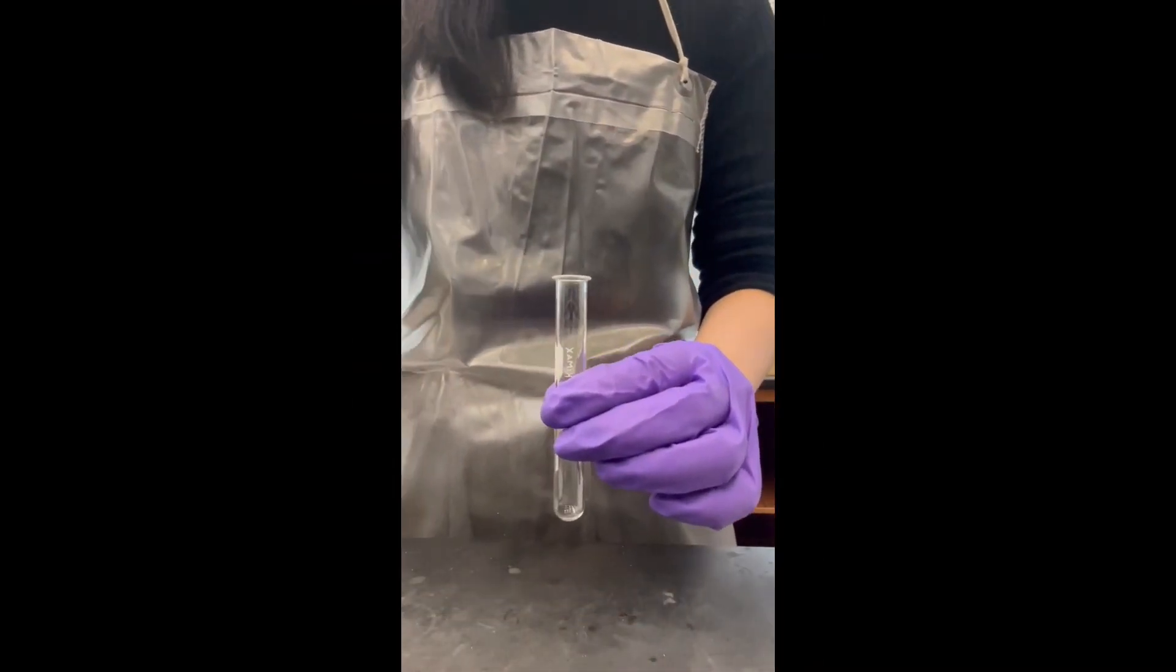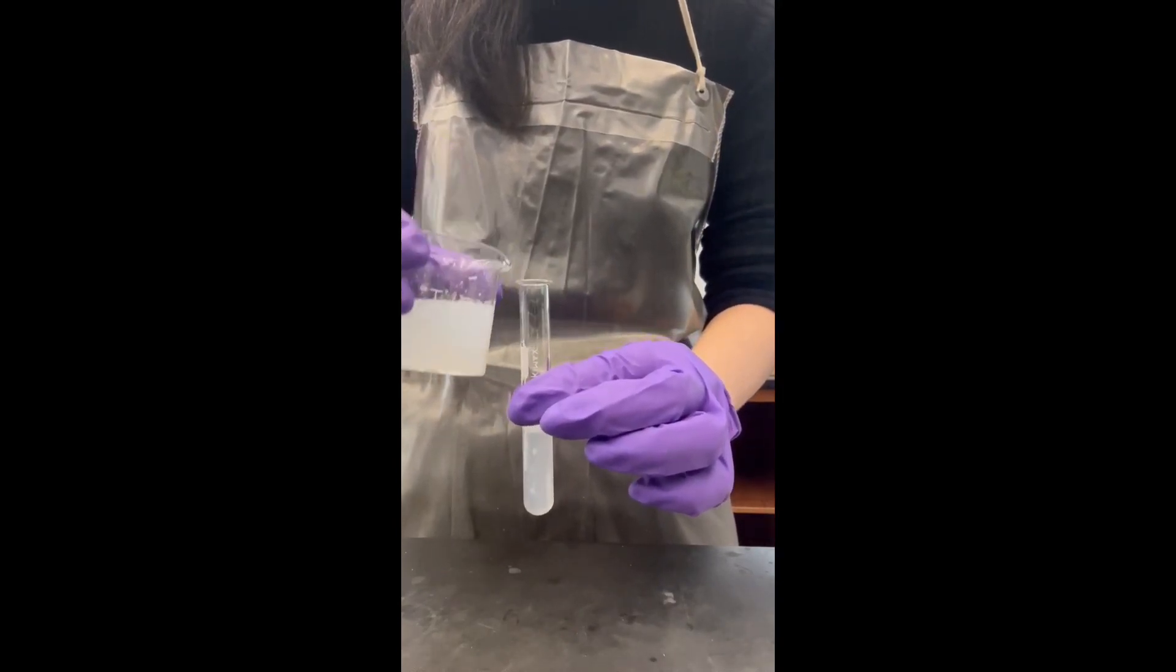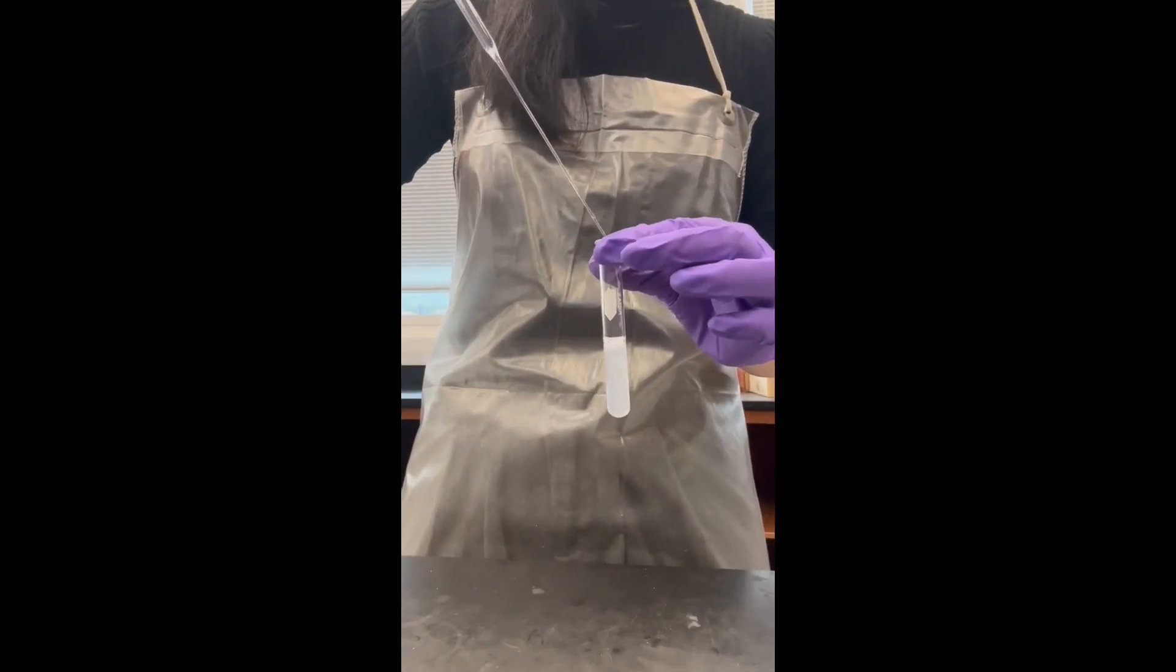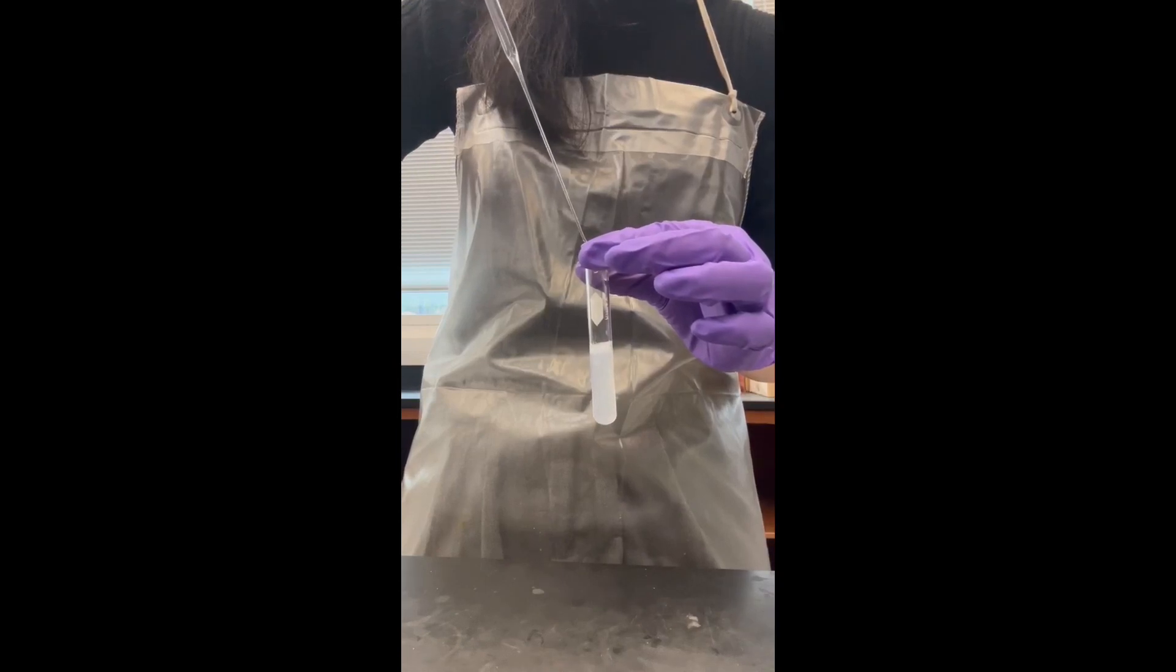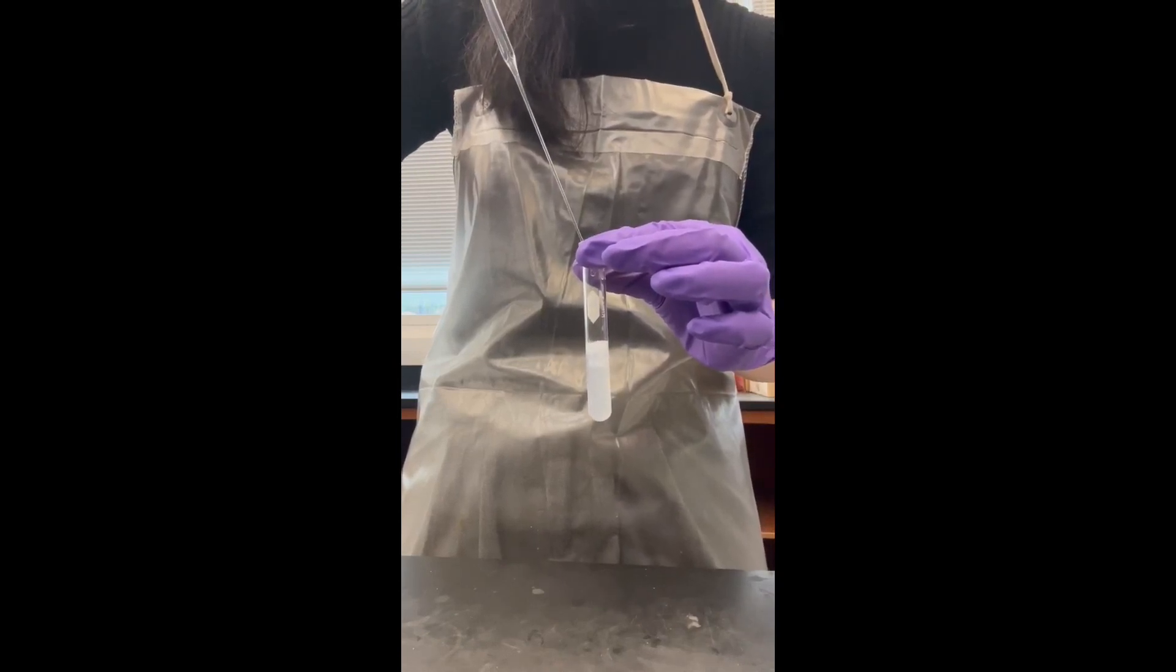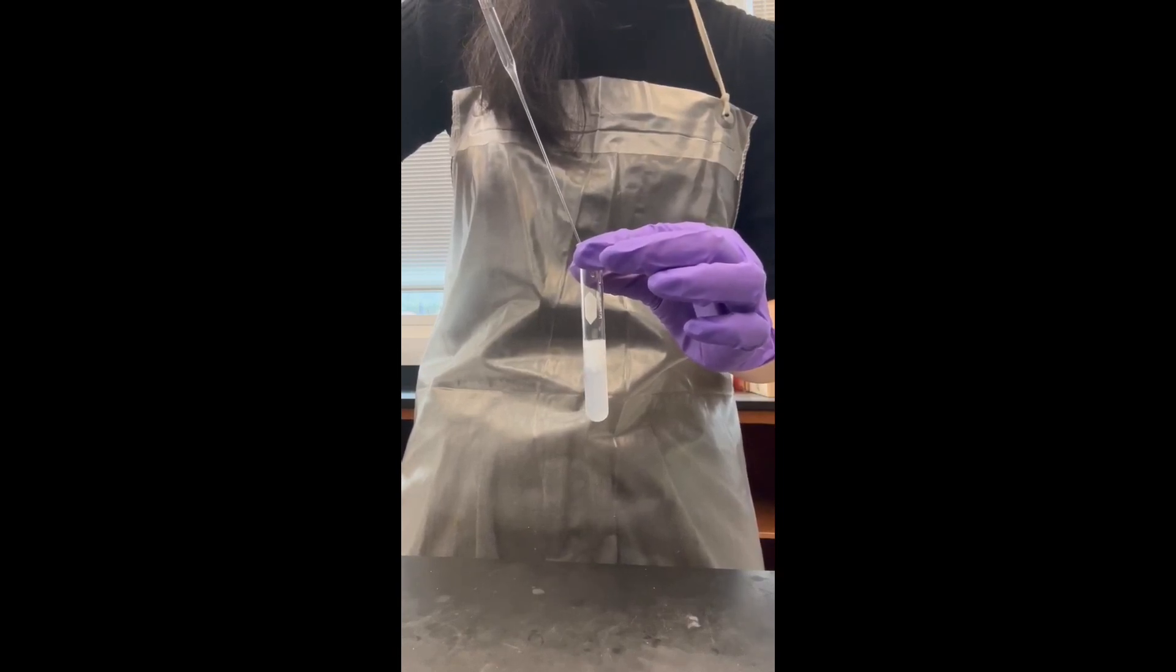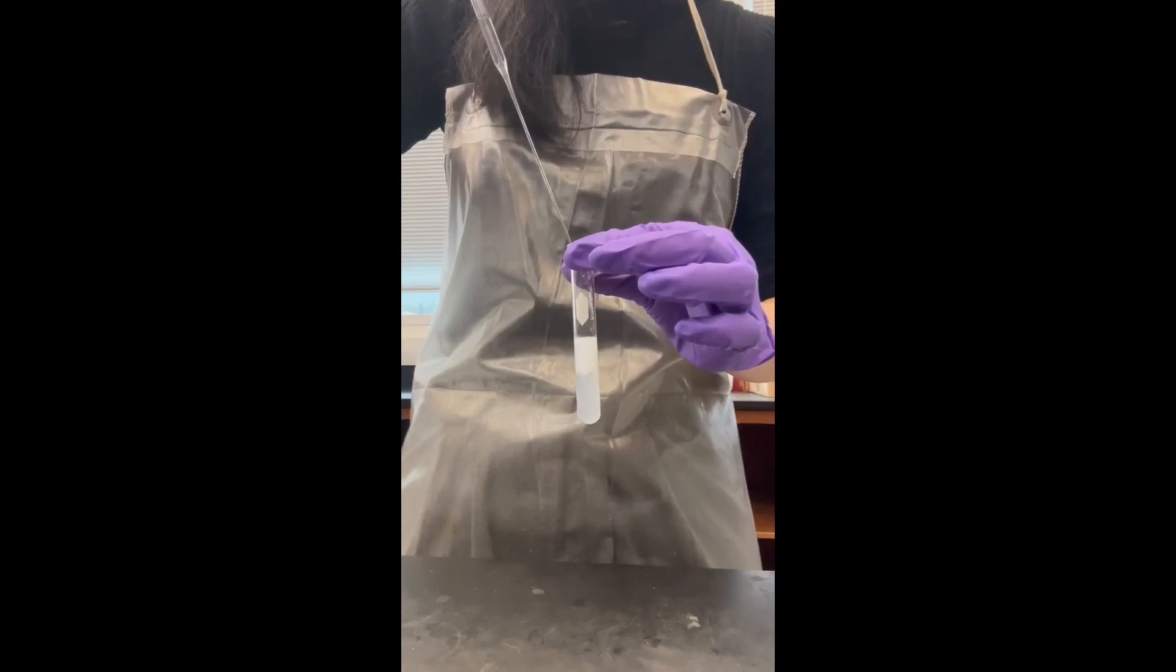For the hard water test, collect six dry and clean small test tubes. Pour about 5 milliliters of sodium soap solution to three separate test tubes. Add 20 drops of magnesium chloride solution to the first tube, 20 drops of calcium chloride to the second tube, and 20 drops of iron chloride to the third tube. Mix the solutions in each test tube well and record your observations in your data sheet.